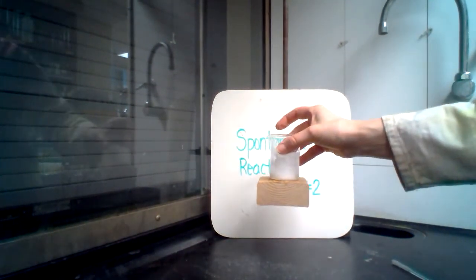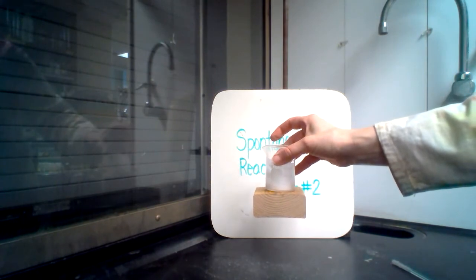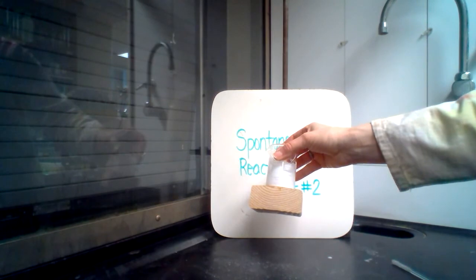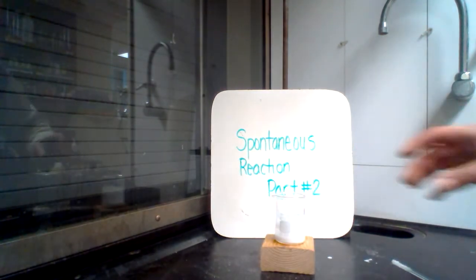Also note that it is successful. I was able to lift the wooden block. It got that cold that it froze to the wooden block. Pretty remarkable.